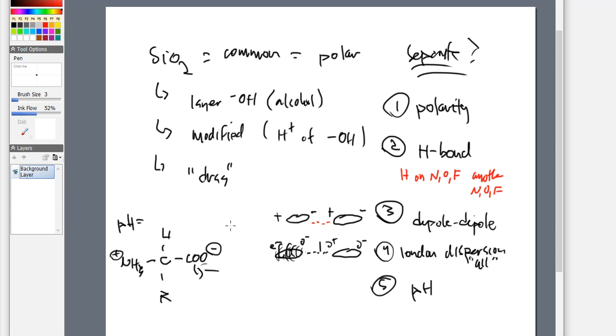And then as we start increasing the pH, going into pH of 7, 8, 9, and 10, eventually what we'll see is that the NH3+ will also lose a proton. And when it does that under certain conditions, all of a sudden that positive charge that was there just completely disappears, and we go to an NH2 amine group. And that now is not a charge any longer. So now that pH really changes that molecule, and the way that it interacts with the silica on the stationary phase is totally different than what it was at pH of 1.